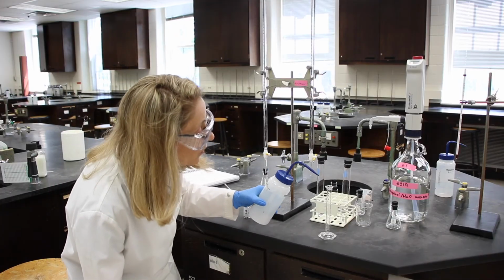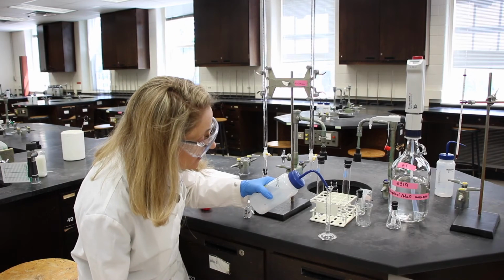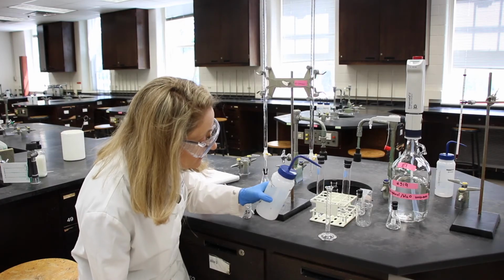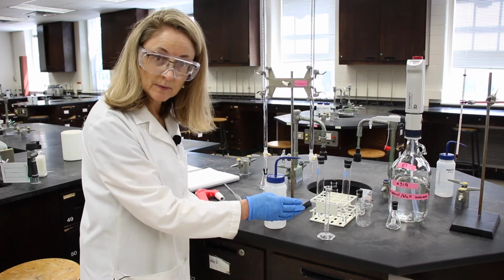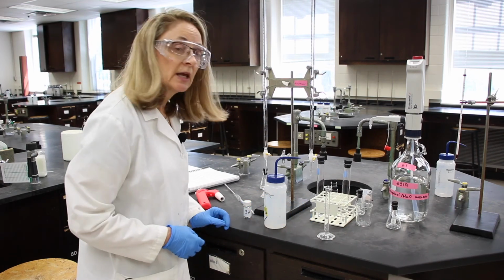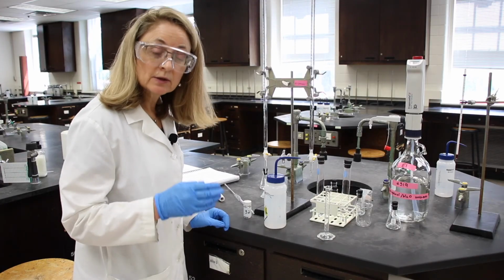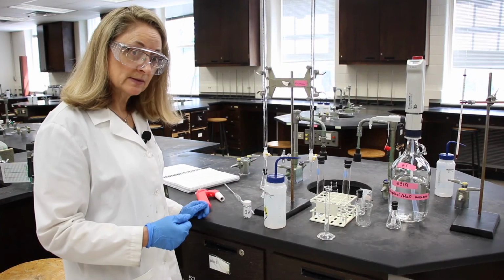Next, we'll add water to a graduated cylinder, and we'll read it. This graduated cylinder is a 10 milliliter graduated cylinder, and the smallest division is 0.1 milliliter. So we'll need to estimate to the hundredth. I'd like you to read this.